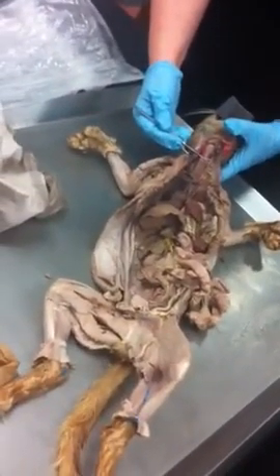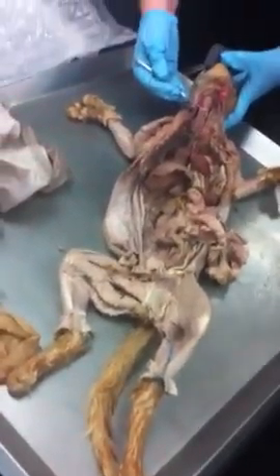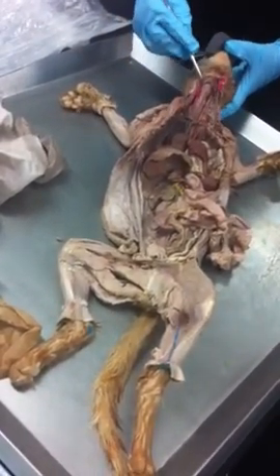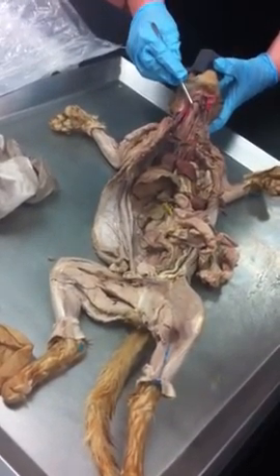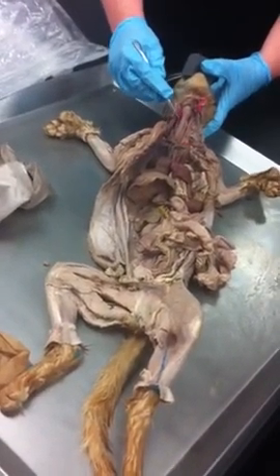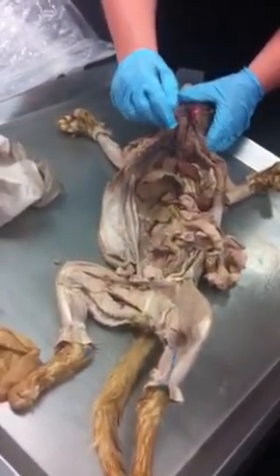Are these vessels, and what's that nerve going with it? That's common carotid and then vagus nerve. Yeah. What's this cartilage? This one's the cricoid. And these tracheal cartilages, what embryonic tissue do they derive from? No fooling you on that stuff.